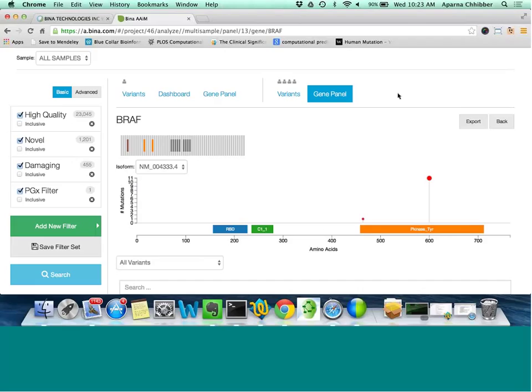Our RAVE software, that's secondary analysis, does have a very detailed somatic detection pipeline. I think there will be a follow-up webinar later in the summer covering that, and that would be a good place to learn more about our mutation detection pipelines and tools.